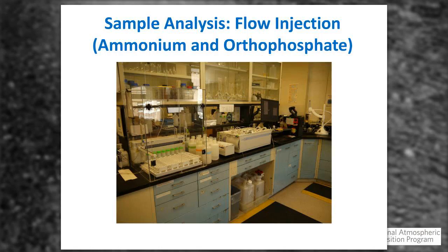Okay, let's go to the next slide. Now we have some pictures in our laboratory. As we talked about, this is primarily the basis of the program, to look at acid rain and obviously the chemicals in our rain. We do our best to measure all the major ion species, and I'll be listing them with the instrument that does the analysis. And really, we do more than acid rain. We look at the full major ion analysis, which represents most of the chemicals in the rainfall.